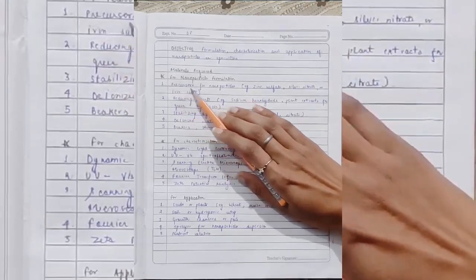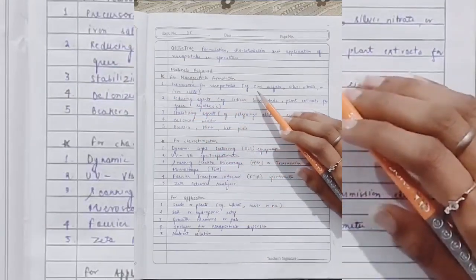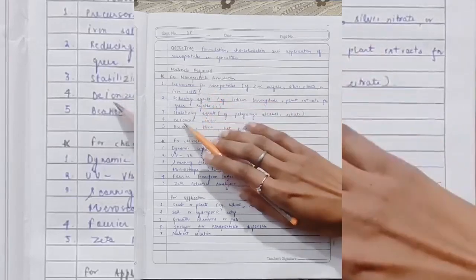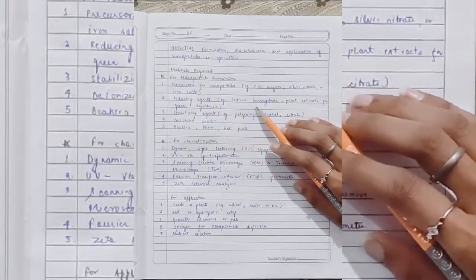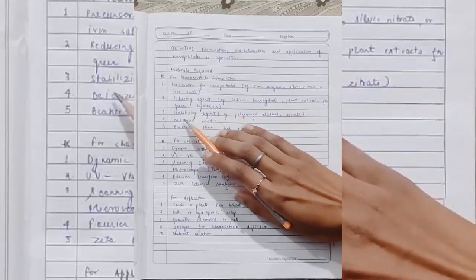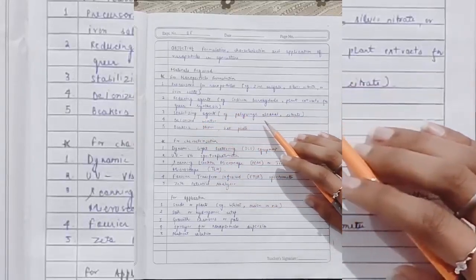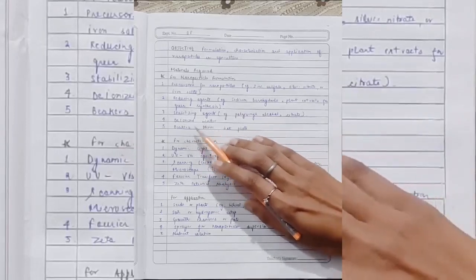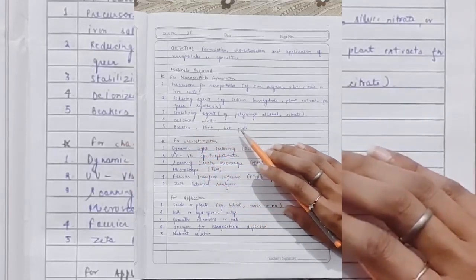First one is the precursor for nanoparticle, that is, we can take zinc sulfate, silver nitrate or iron salts. Second is a reducing agent such as sodium borohydride, plant extract for green synthesis, etc. Third one is a stabilizing agent, for example polyvinyl alcohol and citrate. Next is deionized water, and the last ones are beaker, stirrer and hot plate.